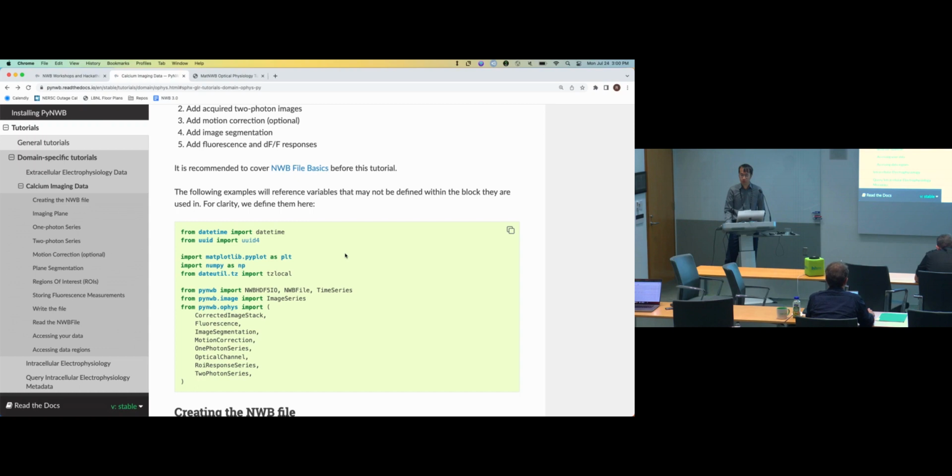You could store the mapping as a separate object, but there's no built-in NWB object to store that at the moment. You can create a custom dynamic table, which is just any generic table, and put that information in there, but then you would want to put that into every file, probably.